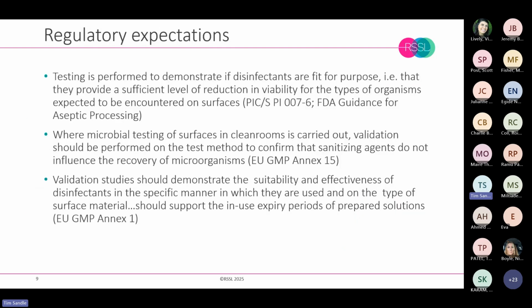And we also need to be mindful of regulatory expectations. So we mustn't lose sight that the testing that we're going to undertake is performed to demonstrate that our disinfectants are fit for purpose, and that is that they provide a sufficient level of reduction in the viability of the types of microorganisms that we expect to encounter on inanimate surfaces within clean rooms and healthcare facilities. And we also need to ensure that our testing is suitably robust, in that we are able to stop the disinfectant activity and adequately neutralize it, so we're seeing what's happening in the practical consequence.